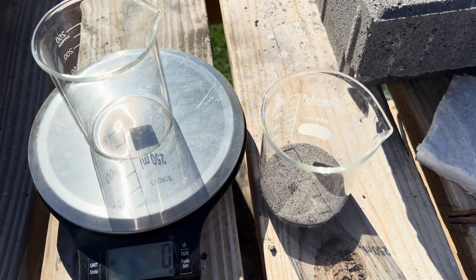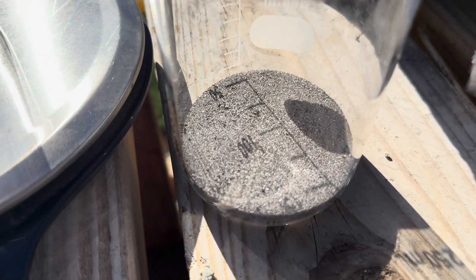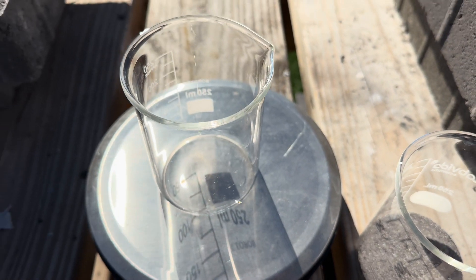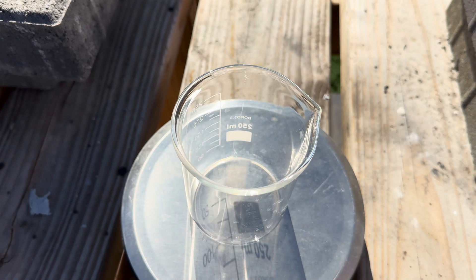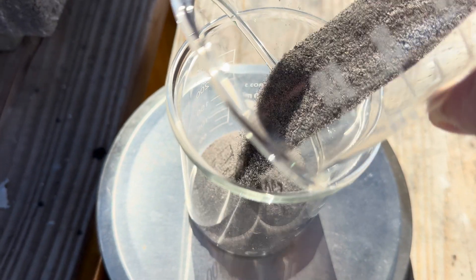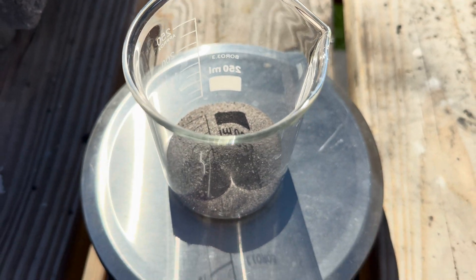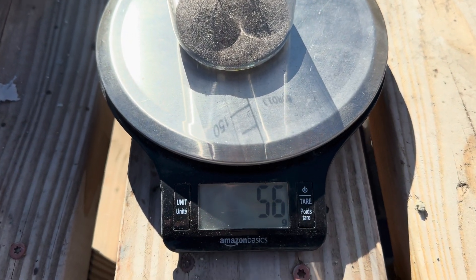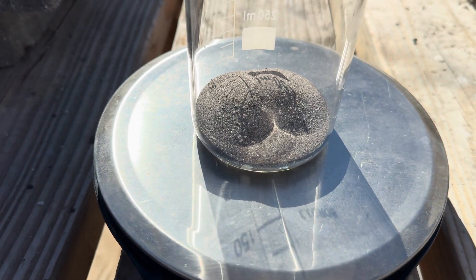Here is the concentrate that we got out of our ore. We're going to weigh it up and see how much we got. And we have 56 grams from 40 pounds of ore.